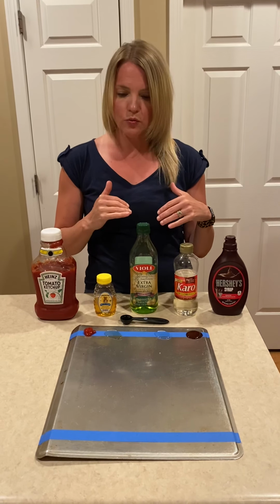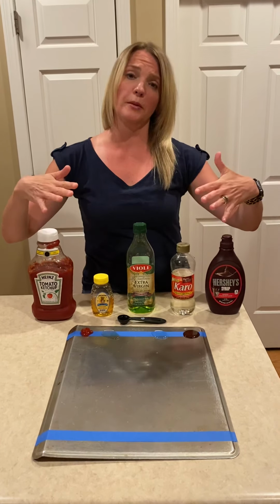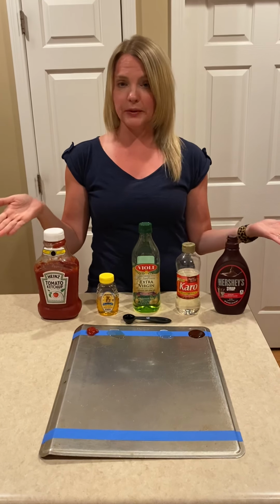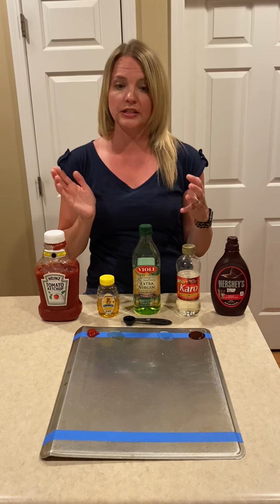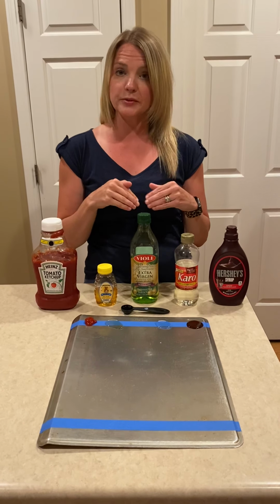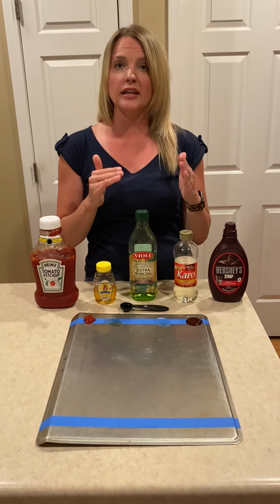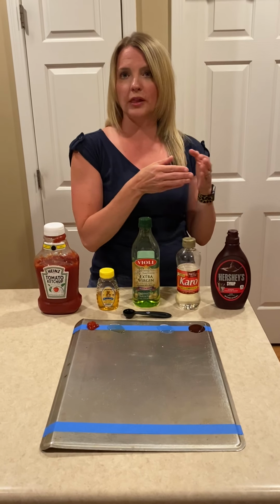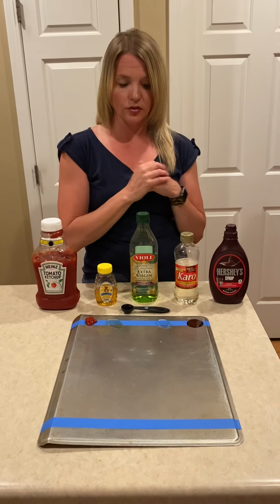So you could run this two ways. You could do the experiment first and have them write their observations and then go back and provide a reasoning, an explanation for the observations that they see. Or what you could do, the way I would like to do it, is have them make predictions first. Have them look at the structural formulas for the different substances that are provided and then make predictions. This one has higher intermolecular forces, this one has lower intermolecular forces. This should have a higher viscosity versus lower viscosity.